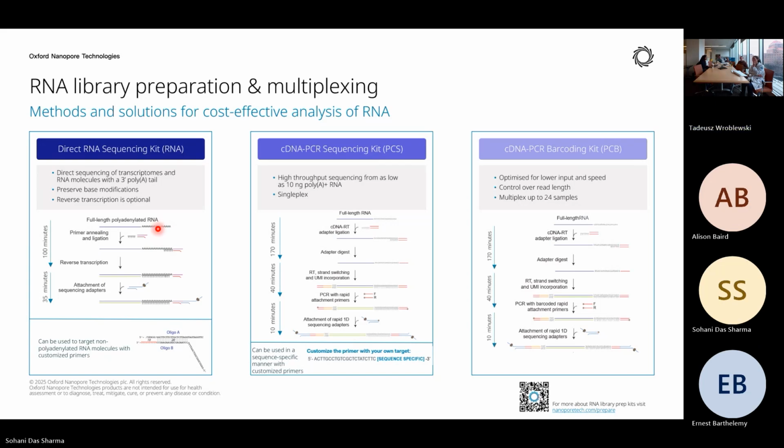or purified mRNA. If there is no poly-A, then we need to add poly-A enzymatically using a polyadenylation enzyme. So there is a primer annealing step, and the primer, as you can see here, has poly-dT sequences, which are complementary to this region here, and that is the reason polyadenylation is necessary for the RNA-based chemistry.